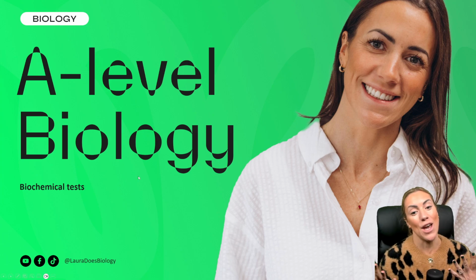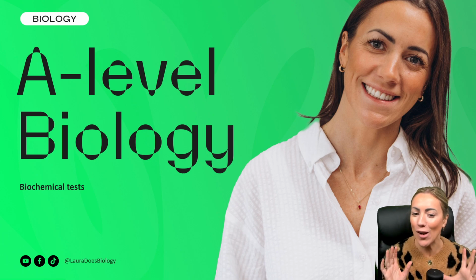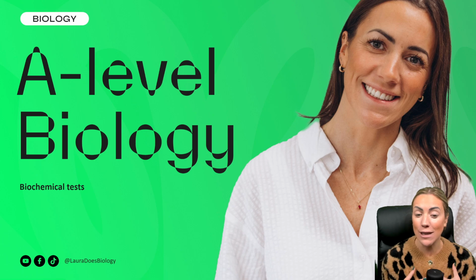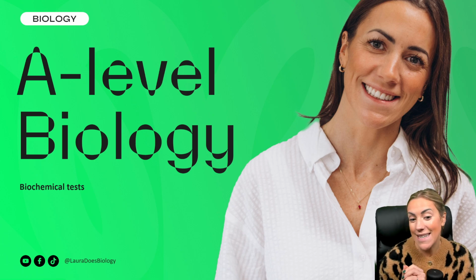Okay, for this video, we are going to recap all of our biochemical tests. Now, you did a lot of these at GCSE, and there's a couple of extra bits that we've got to cover for A-level, like the test for a non-reducing sugar, and also how we can make the Benedict's test fully quantitative. So hopefully you're going to find this useful.